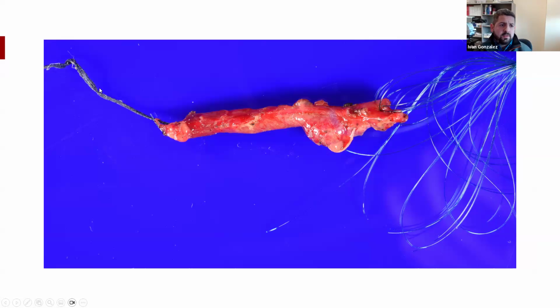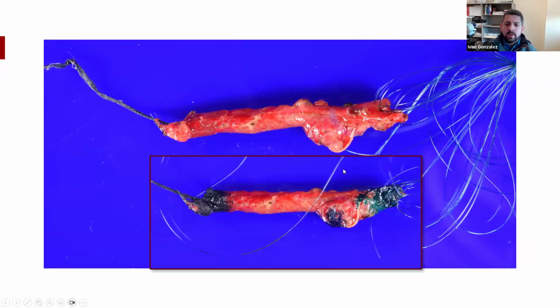So in this case, the fibrous plate is here, then the gallbladder, and then here you have your bile duct. If you want, you can ink in your grossing, as long as you identify and say which block is which. I don't think it's necessary, but it's useful because once you section it, you can rearrange it again and get it back to the anatomic configuration.